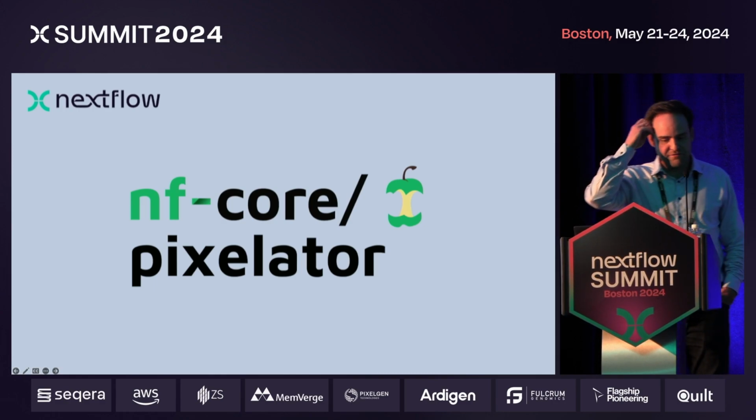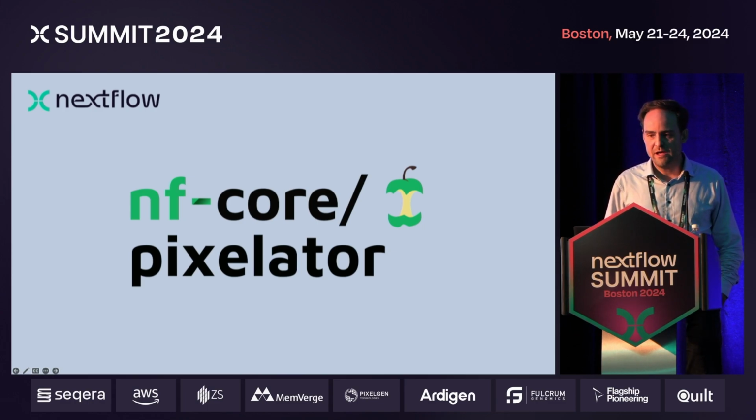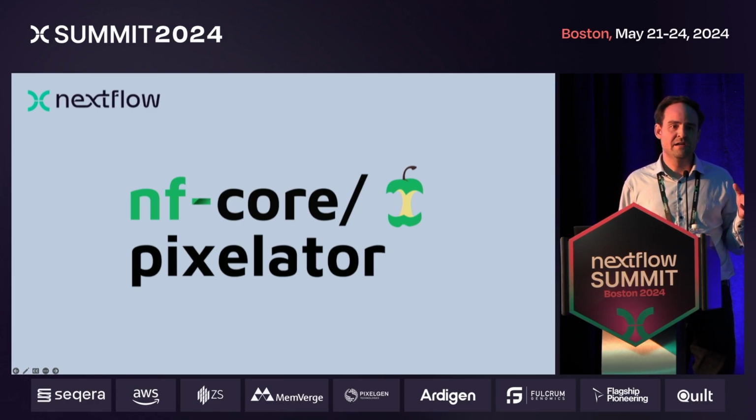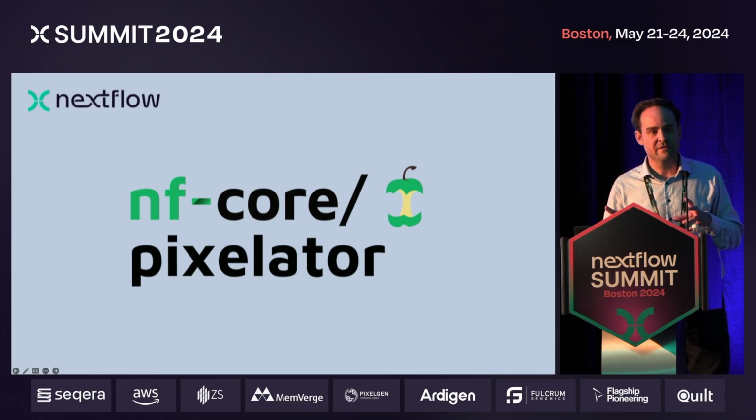Right, so nf-core Pixelator. We are very thankful to nf-core and Nextflow. It has been a cornerstone part of our technology in order to ship to our customers in record time. When we started the company, it was basically a Python package and lots of different command line tools. And the reason that we have kept using Python for the logic is because we are trying to maximize the amount of developers that you can put on the problem, on the intelligence of how to create new algorithms for MPX.